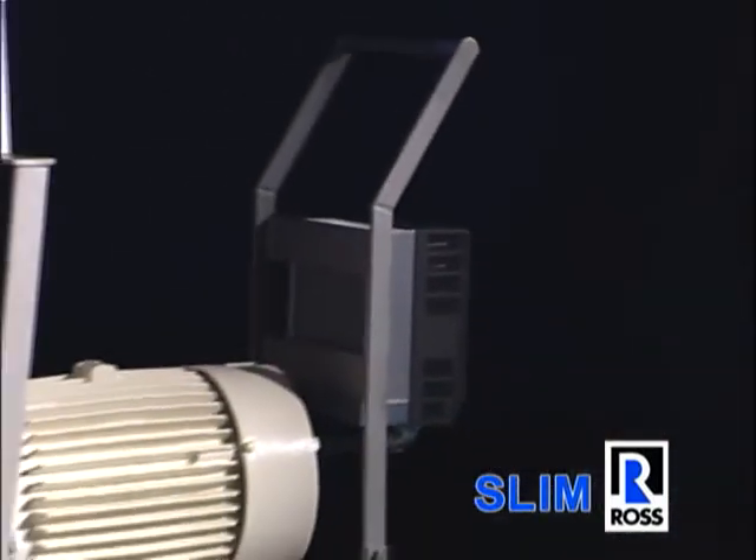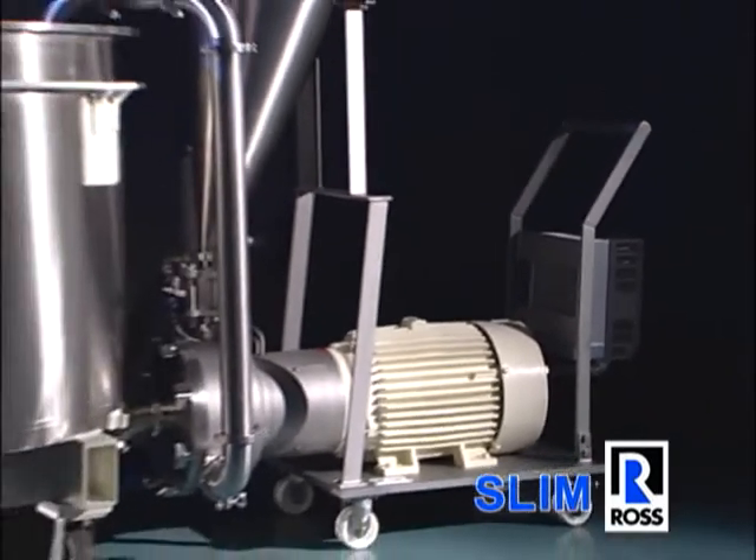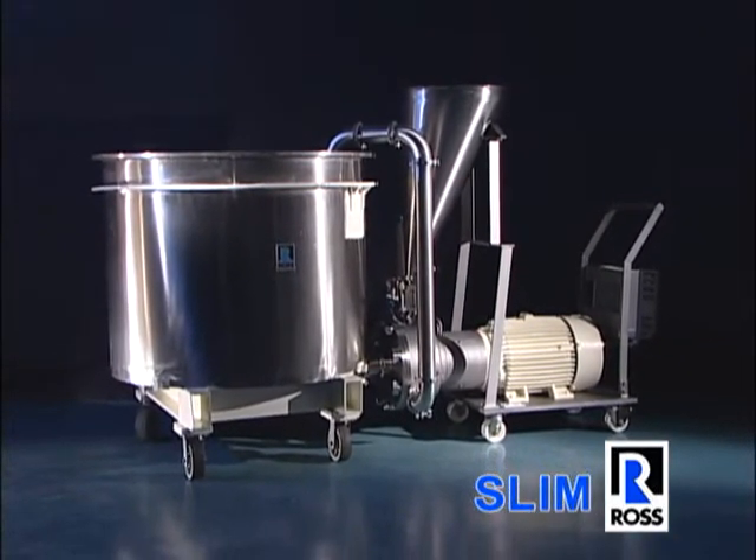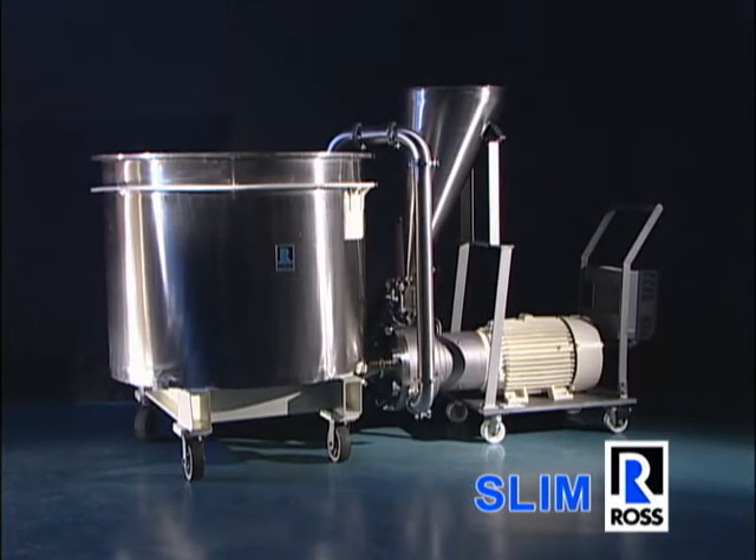Ross Slim technology helps to contain free solids and maintain a clean and safe working environment. It also speeds up processing times and enables manufacturers to lower their costs.